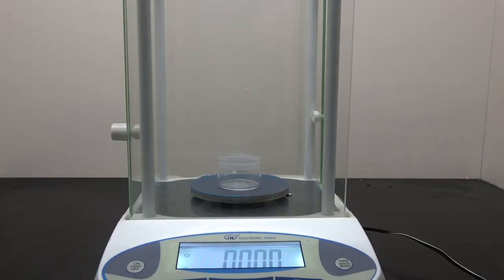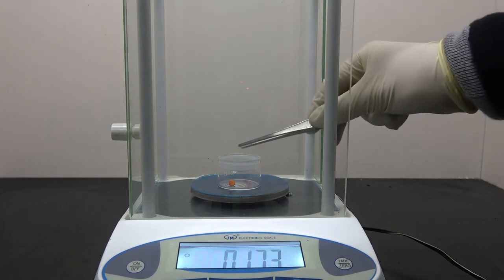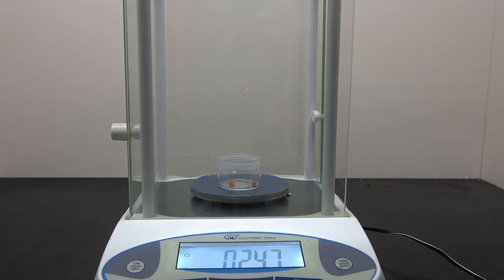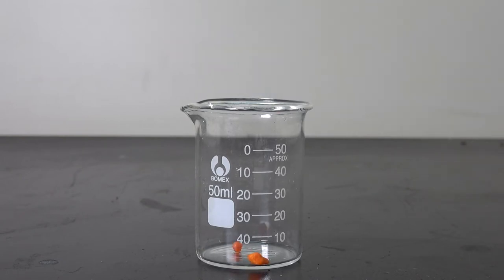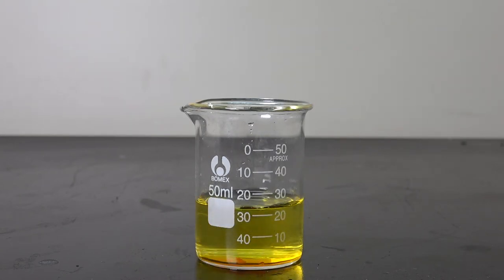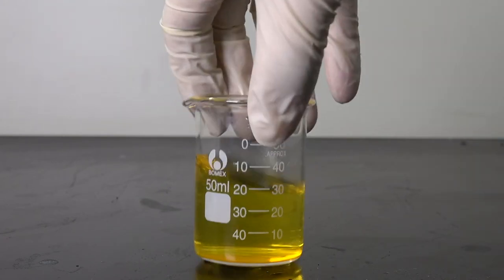With the help of my trusty analytical balance, I weighed out about 2.5 grams of hexachloroplatinic acid. An interesting property of hexachloroplatinic acid is that it is highly hygroscopic. You can see the crystal is getting wetter and wetter as it absorbs the moisture from the air. With the addition of 35 ml of distilled water, the crystals are quickly dissolved into solution.